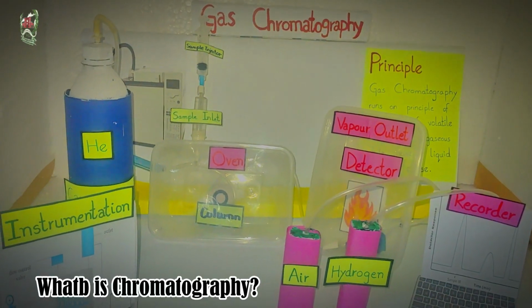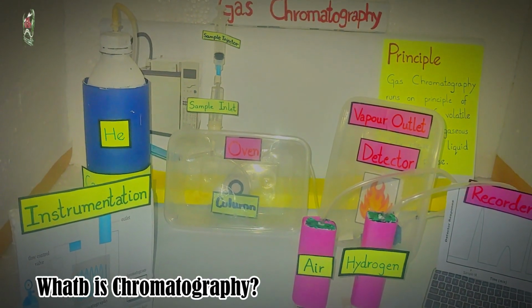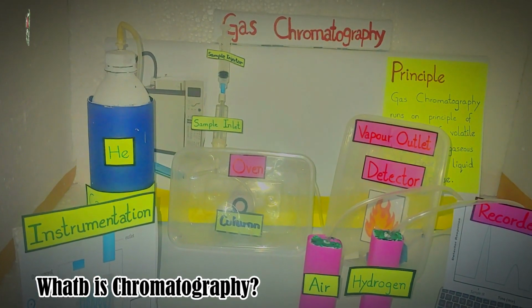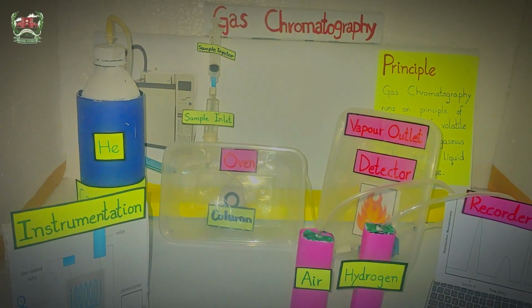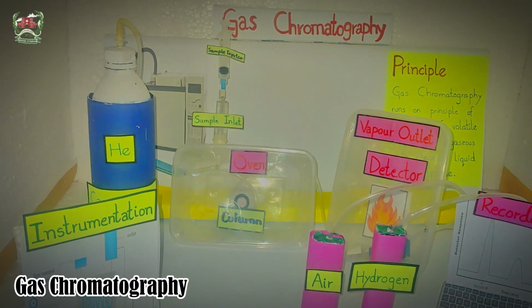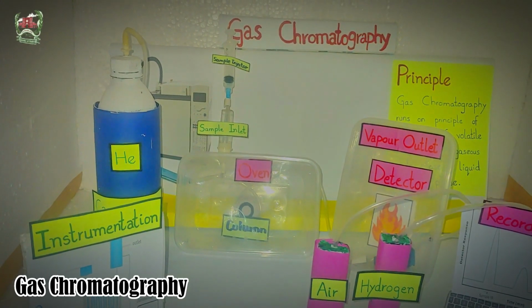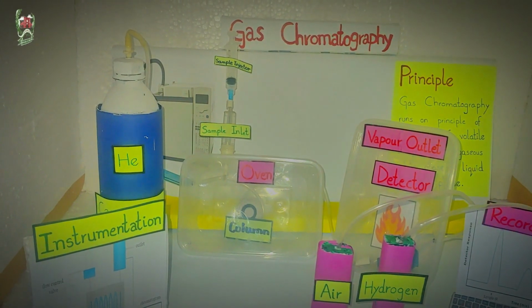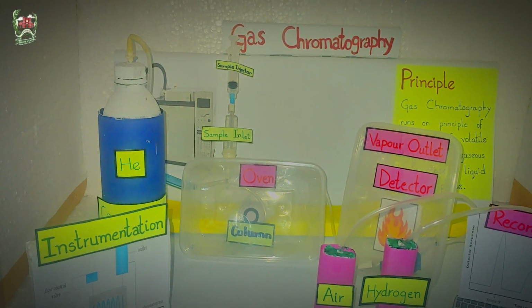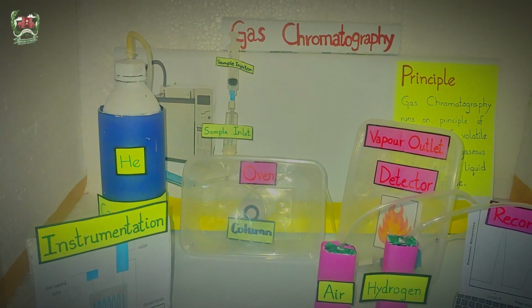So what is chromatography? Chromatography is a process for separating the components of a mixture. So this is the basic definition of chromatography. Now moving toward the definition of gas chromatography. Gas chromatography is a technique in which we determine and separate out the different components of a mixture, in which we use gas as a mobile phase and solid or liquid as a stationary phase. So this is the basic definition of gas chromatography.